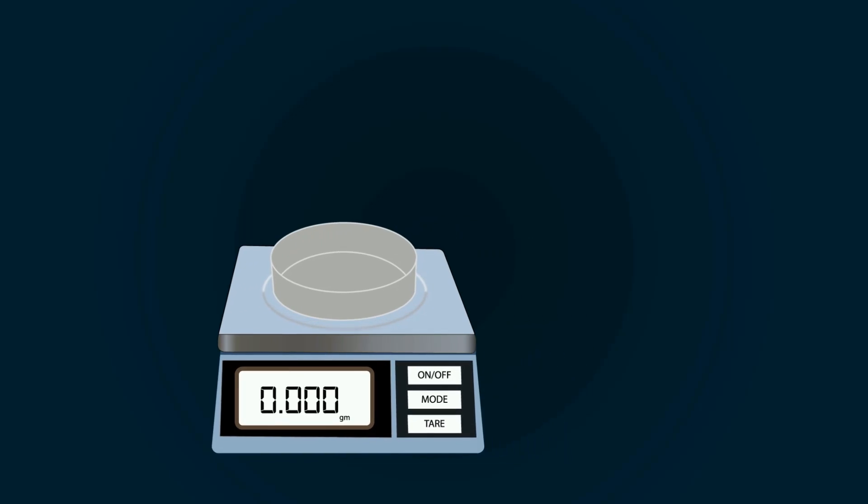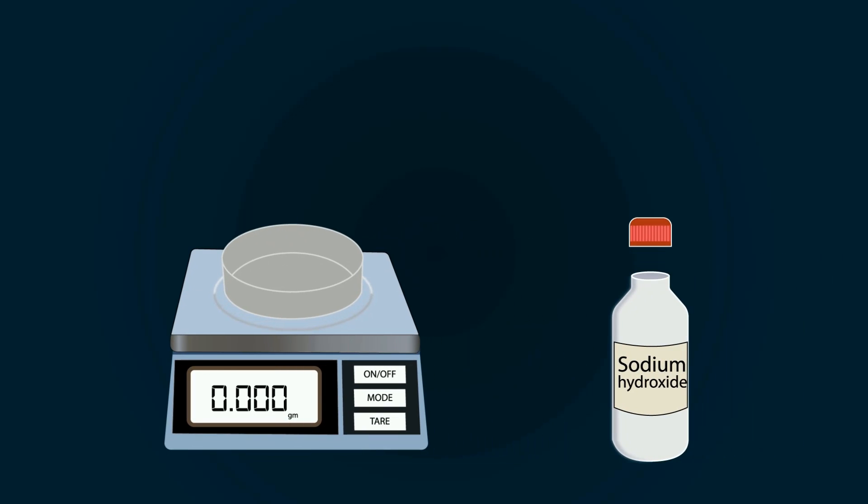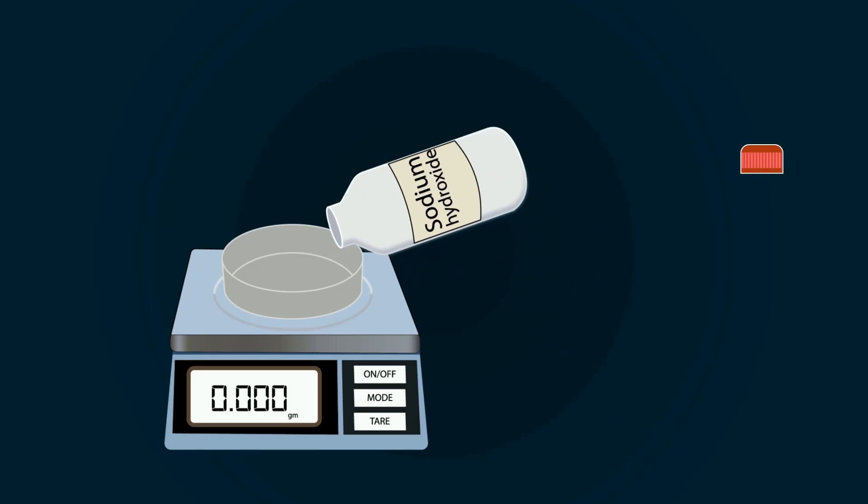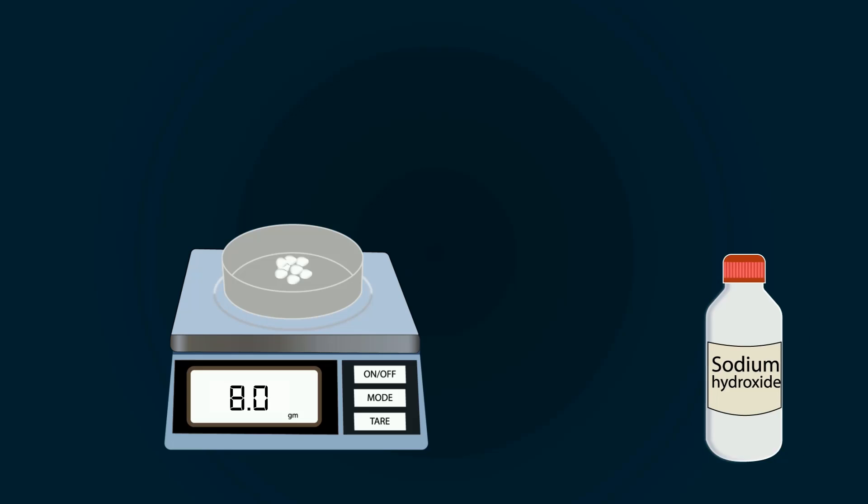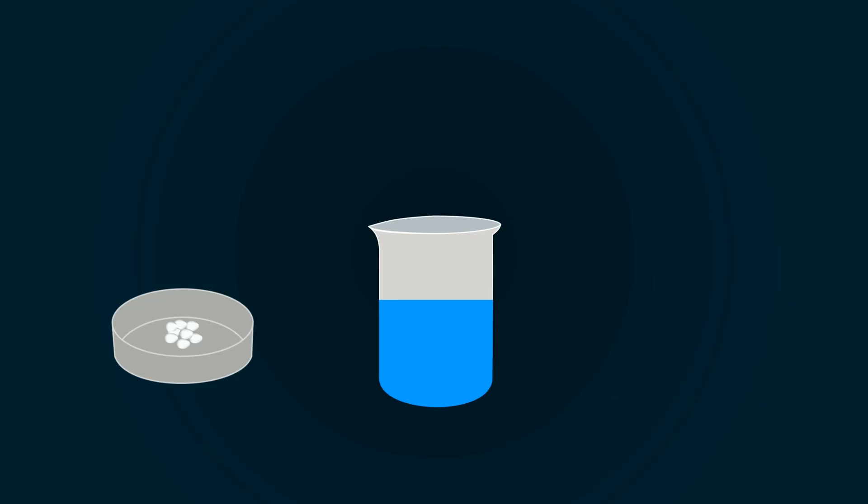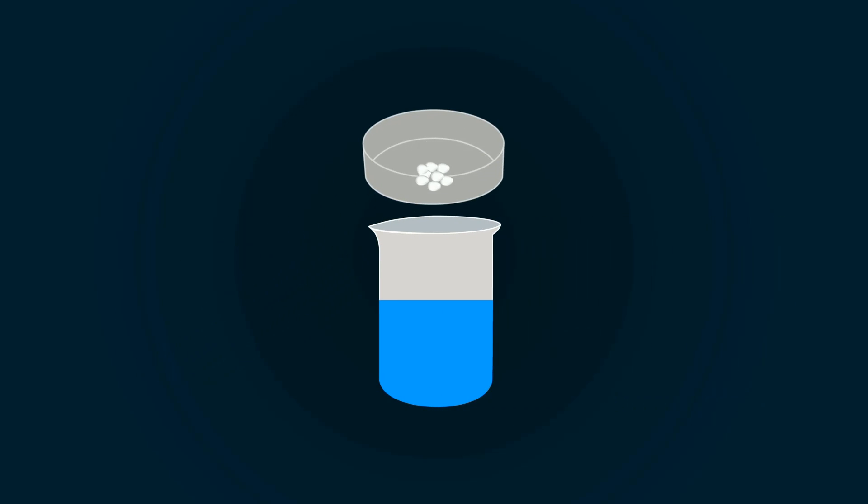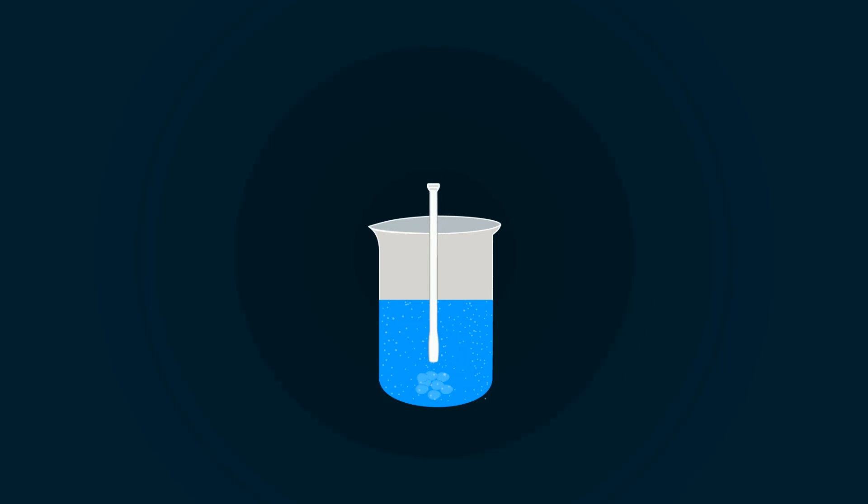Now add sodium hydroxide into the petri dish and measure it up to 8 grams. Add this into the distilled water. Now stir the solution to make a homogeneous mixture of sodium hydroxide.